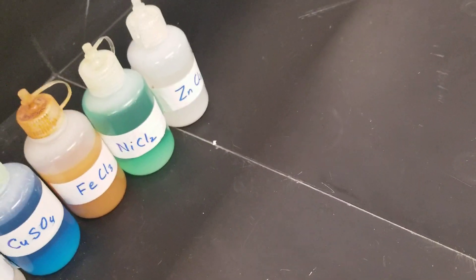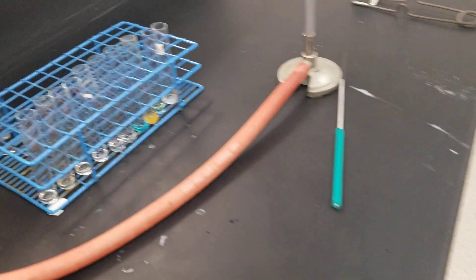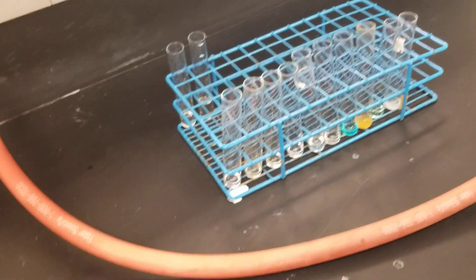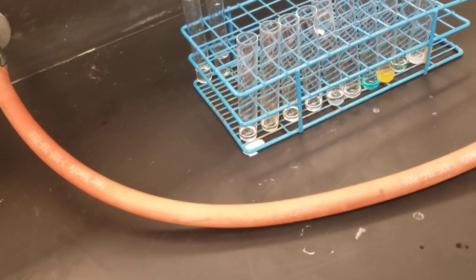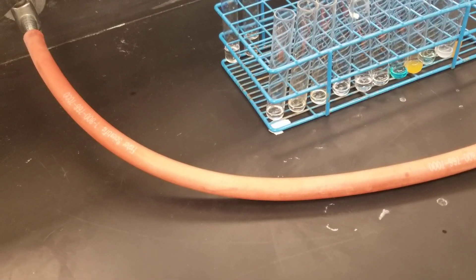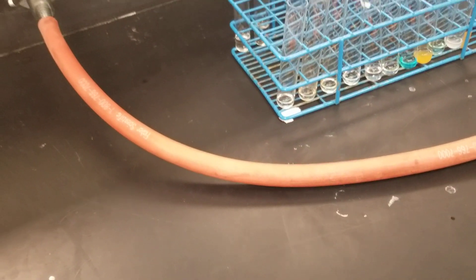First, we will do the testing of the metal and halide with all the known and unknown solutions. Then, with the help of the results from the known metal halide solutions, we can identify the metal and halide in the unknown solution.